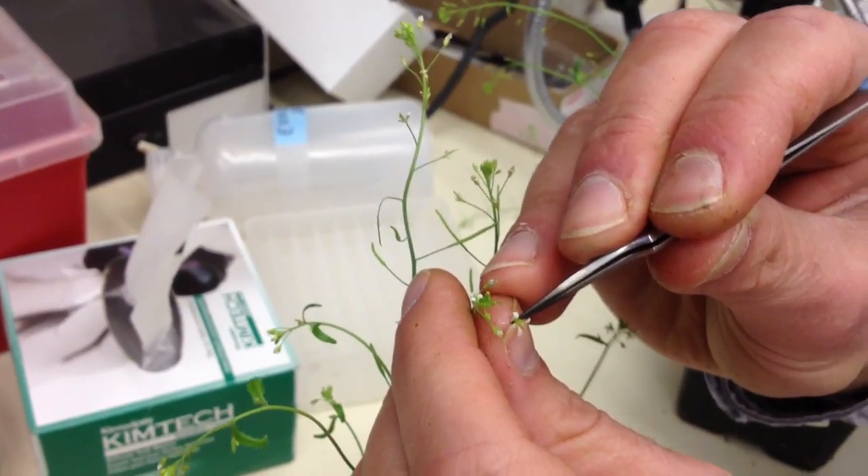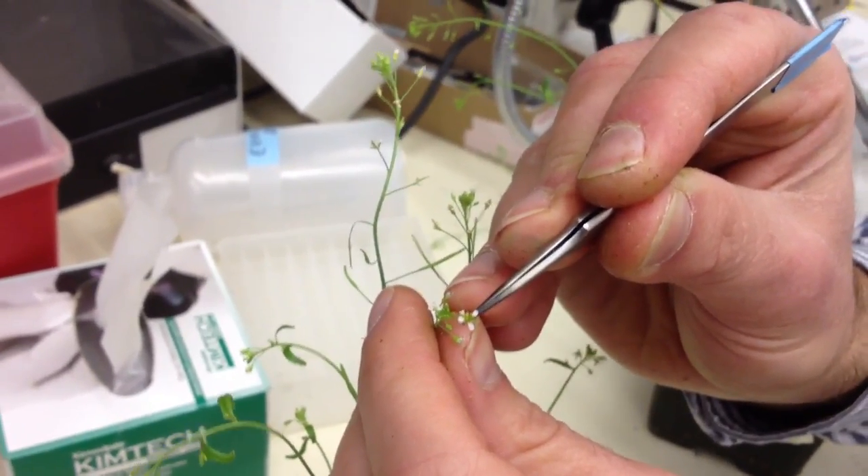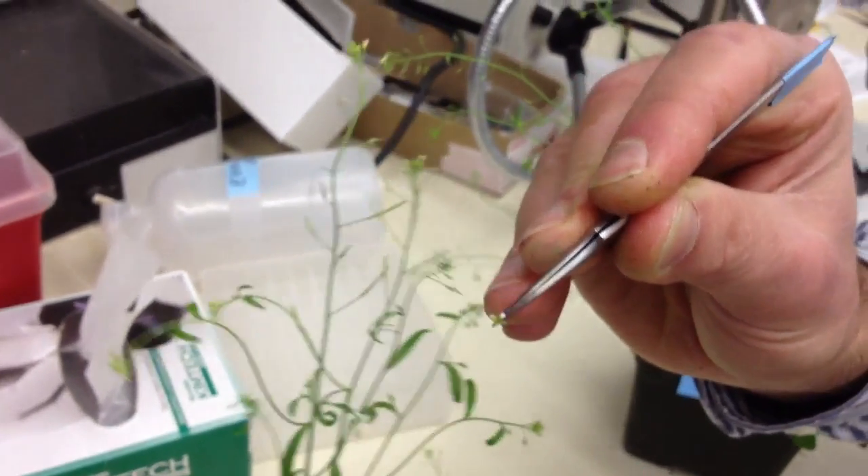By grabbing it at the base of the flower, you'll notice the flower kind of opens up a little bit, and that exposes the male part of the flower — the stamens, or the anthers — that have the pollen that will allow for crossing to occur.